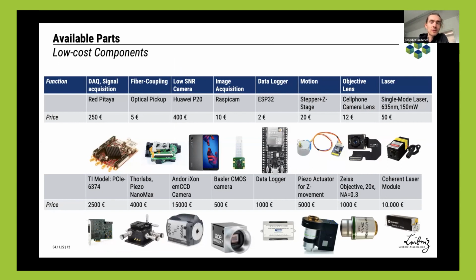So you can, for example, replace very expensive cameras. We did that with the Cellstorm, which was already nicely mentioned, thank you, with your cell phone camera, if you know how to process the data, because they always come with problems. So there are already tons of different devices you can use for your research in order to create super resolution images. We created many different devices, where one, for example, was the Cellstorm.